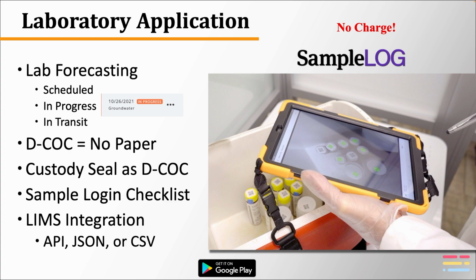If you've ever dropped samples off at a lab, you've seen the lab login person with a clipboard and a paper login checklist. That same login checklist is built into the Sample Log app and is customizable by the laboratory.